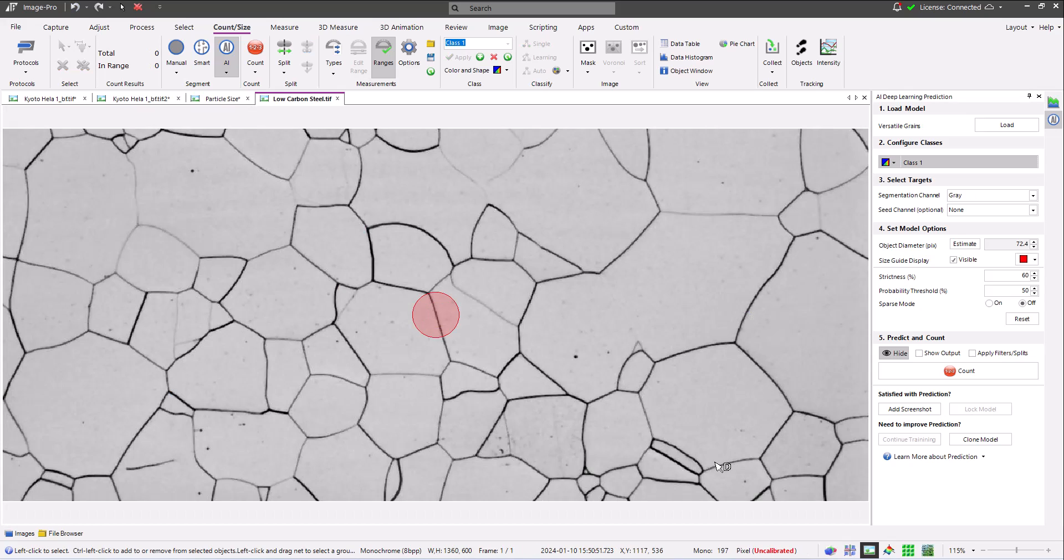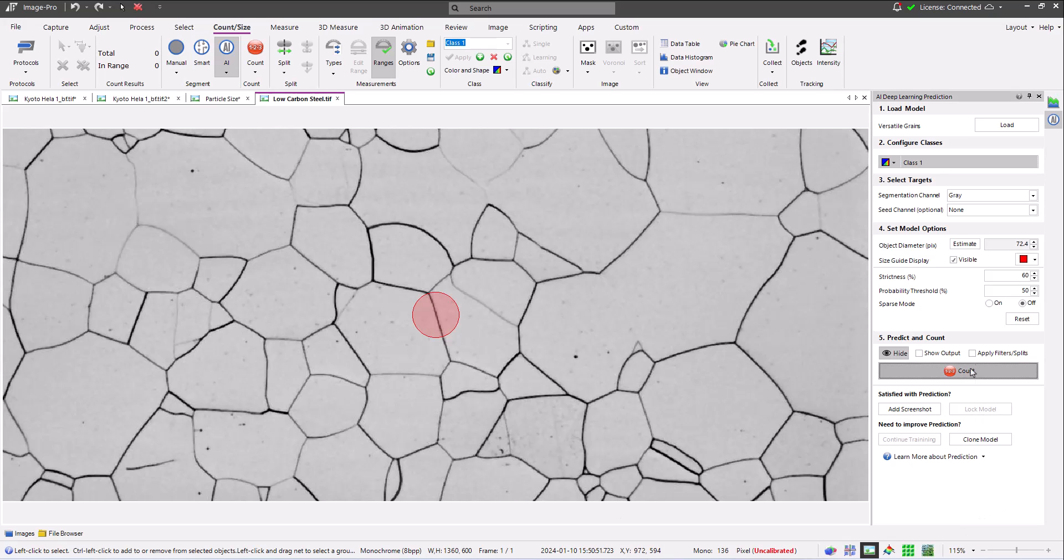This model is the versatile grain model. It's trained to identify individual grains in metals, which you can see it doing in this steel example.